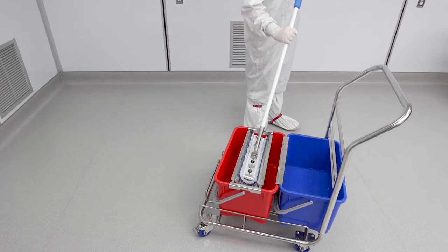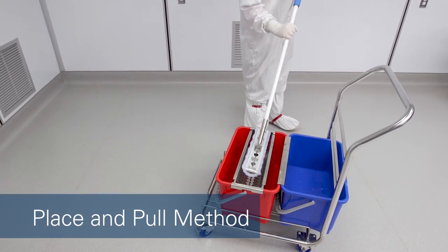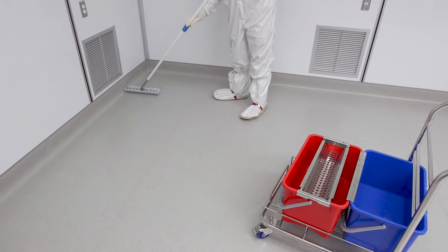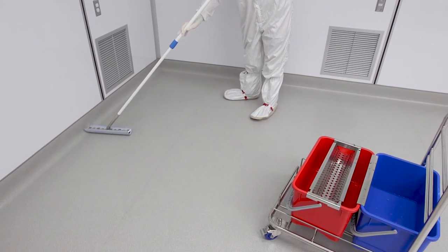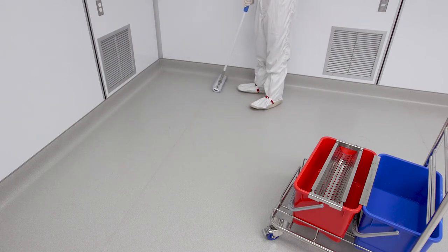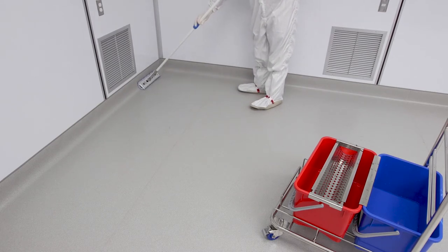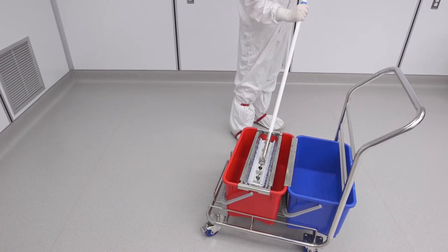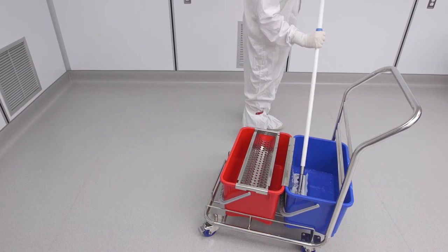Mop using the place and pull method. The ringing and rinsing cycle is the same as the S-curve method of mopping. Start from the corner opposite the room's exit, covering about one square meter at a time using overlapping strokes. Ring completely into the waste bucket. Wet the mop head with the cleaning solution and repeat the cycle.